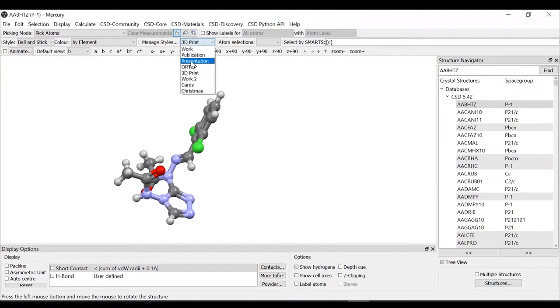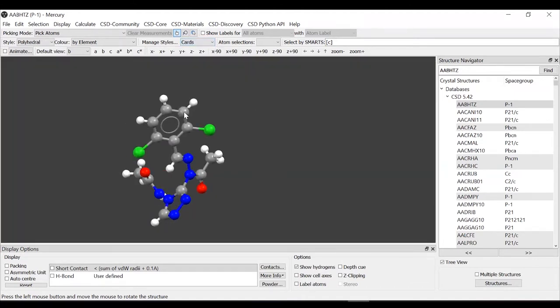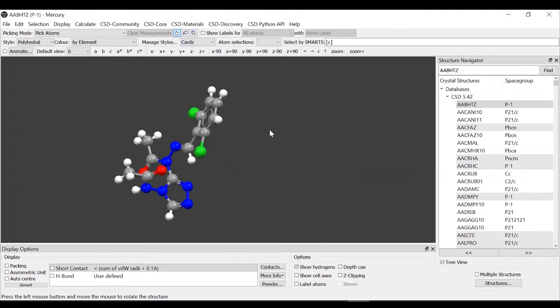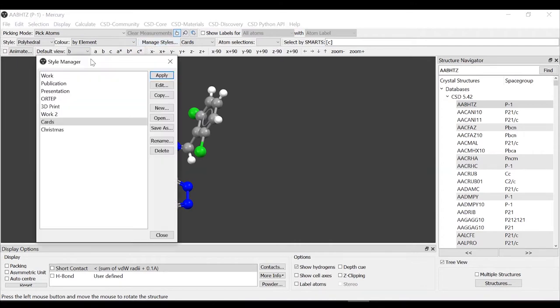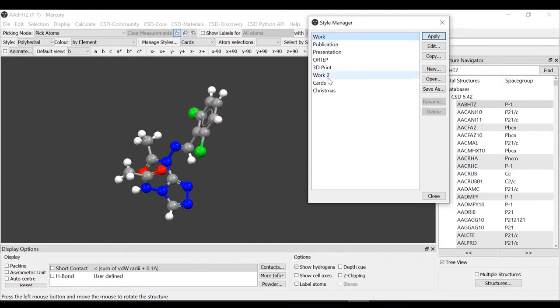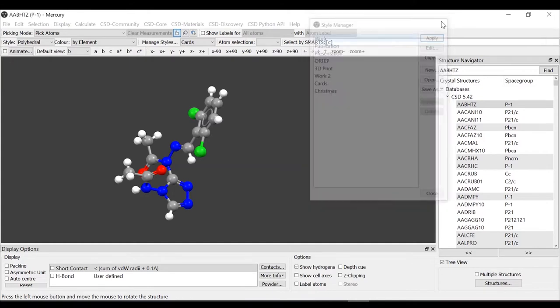I have a series of personalized styles where I chose the color, size, and background colors. To do so, you can double click on style manager. From manage styles, you click on it, it brings up the style manager where you can edit each of the styles or you can copy it and then edit to create your own style. This exercise should also be on the handout as a bonus.